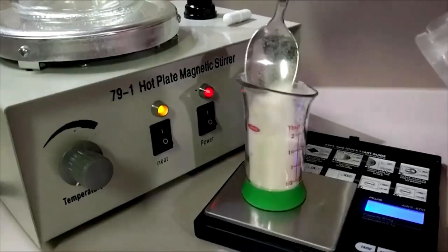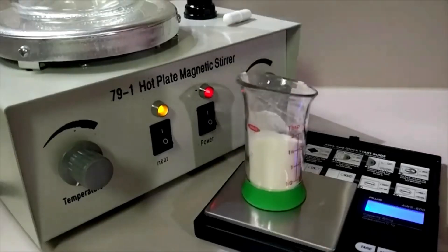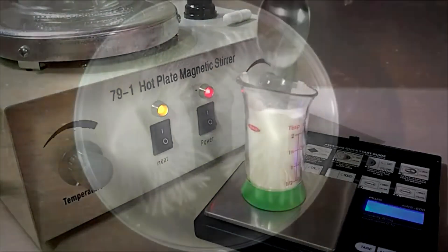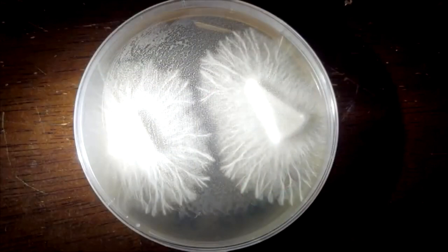We have discovered that less nutrients seem to be best when it comes to rhizomorphic growth. It seems that if you starve the mycelium it really branches out to search for more nutrients, resulting in a branched look similar to a root system.